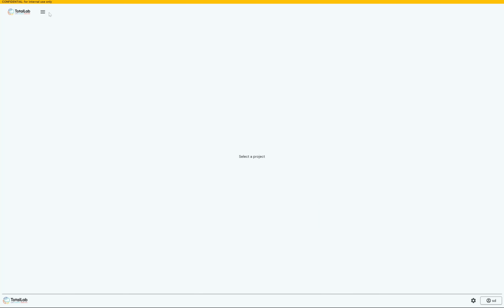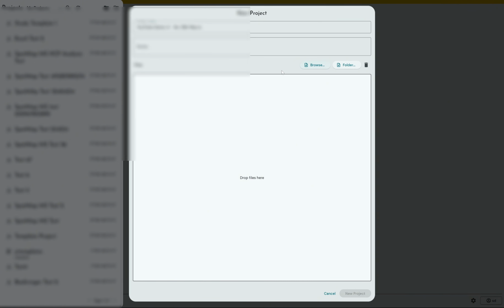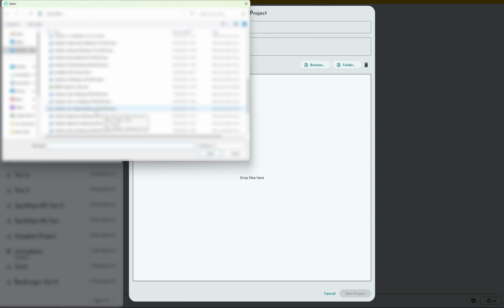So I'll sign in and I will create my new project. Let's just call this YouTube Demo 4, no VBA macro.